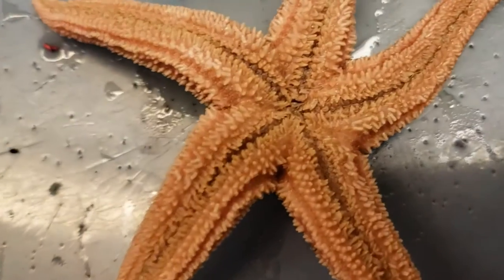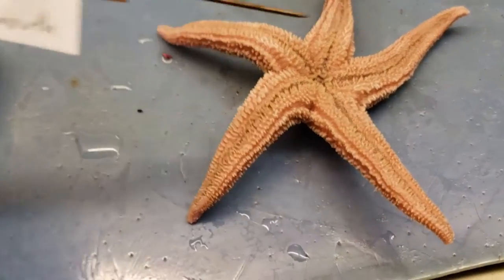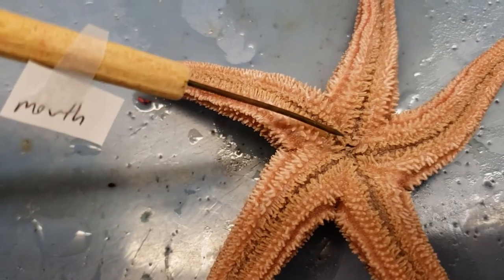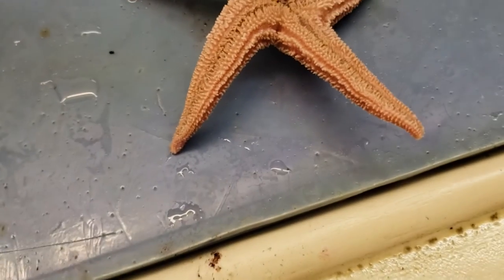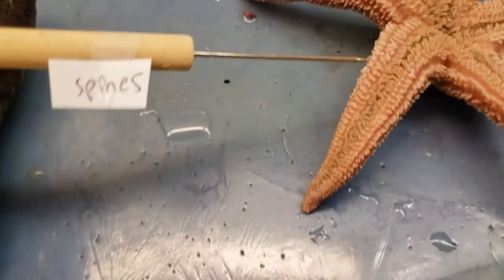Inside the center — it's kind of hard to see — but that's where you'll find the mouth for this thing. Deep in there, that's where the mouth would be. Inside of there is the stomach, which we really can't see at the moment. Some spines, good protective structures, are found on this outside area here.